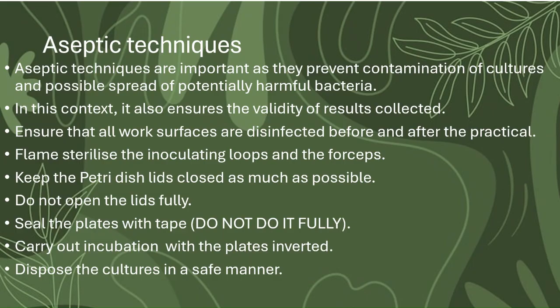One of the first things you need to do is ensure that all work surfaces are disinfected before and after the practical. Flame sterilise the inoculating loops and the forceps. Keep the Petri dish lids closed as much as possible. Please do not leave the lids open.